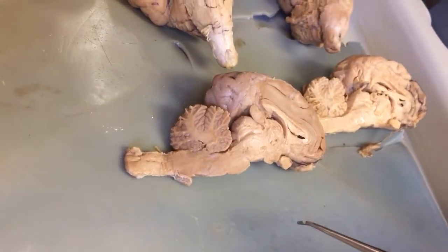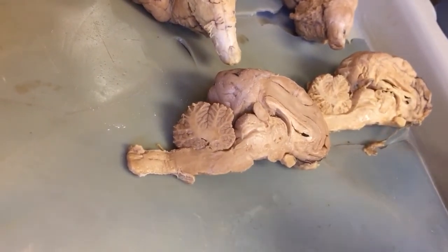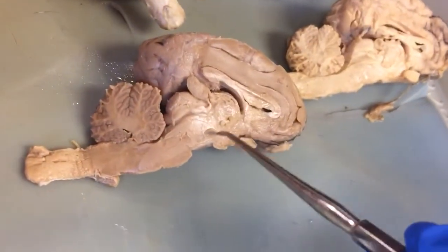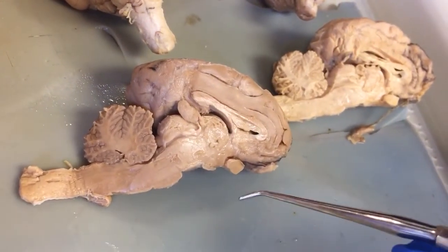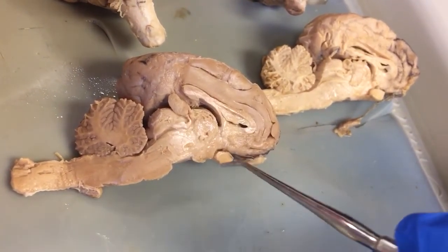The third ventricle is fairly minor, and the anterior commissure is similar to where the foramen of Monro is. So this big opening is the foramen of Monro, and your third ventricle and anterior commissure are really more like grooves.